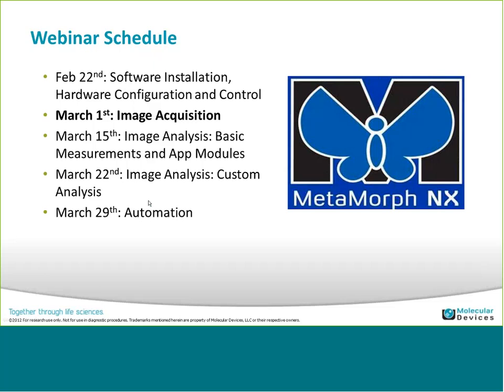just a reminder from last week, the hardware configuration is all done inside the application. The hardware setup tab is where you'll come in and configure your cameras. That's the camera setup. You do the install devices and load devices, which are the same dialogues that you've seen in Metamorph 7. The thing to keep in mind is that Metamorph NX uses the same drivers that are available in Metamorph 7. So you have the stability of the drivers as well as the large number of different pieces of hardware that we support. And that is what is available in Metamorph NX.